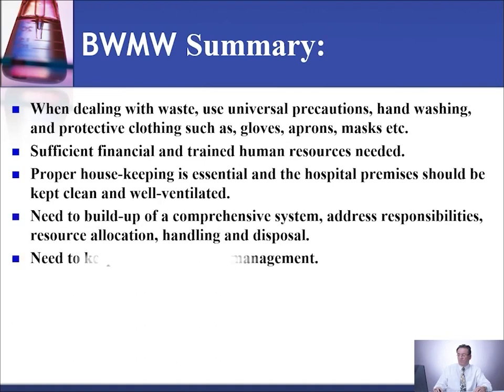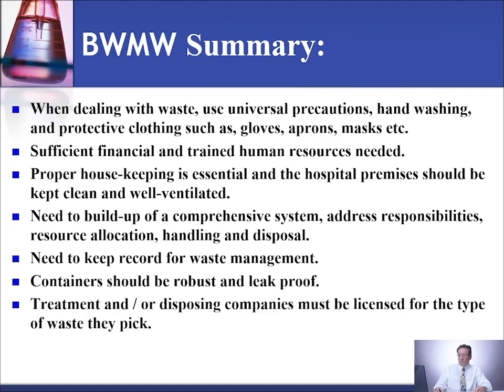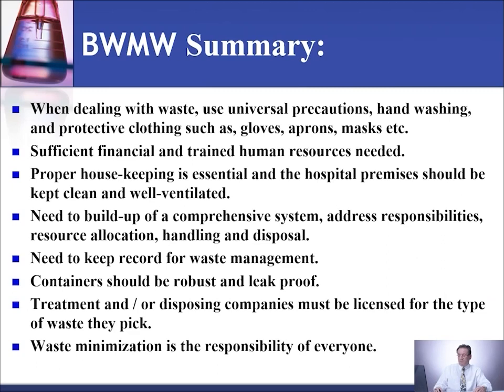Need to build a comprehensive system that addresses responsibilities, resource allocation, handling, and disposal. Need to keep records for waste management. Containers should be robust and leak-proof. Treatment and or disposal companies must be licensed for the type of waste they pick up from you. Waste minimization is the responsibility of everyone as applicable.